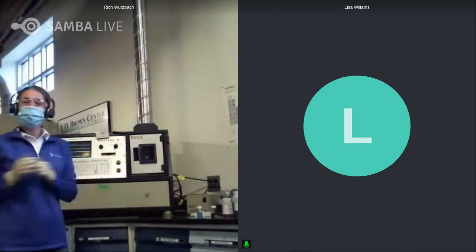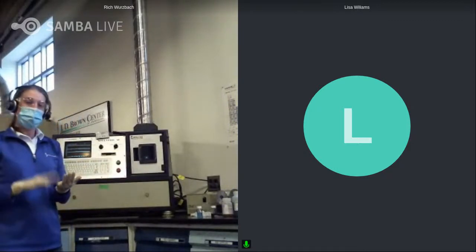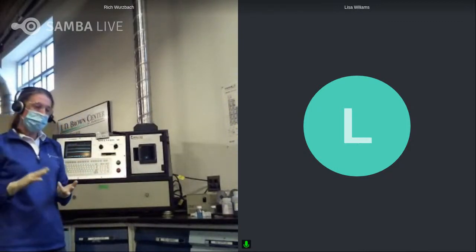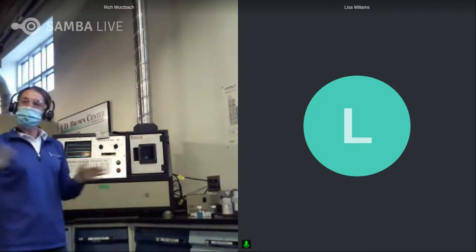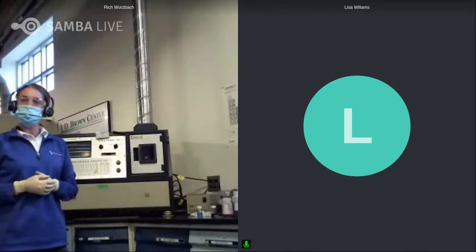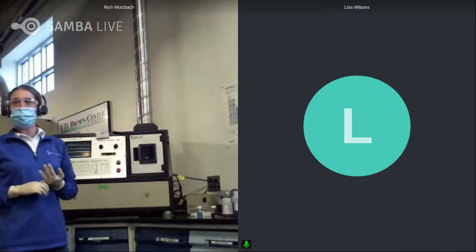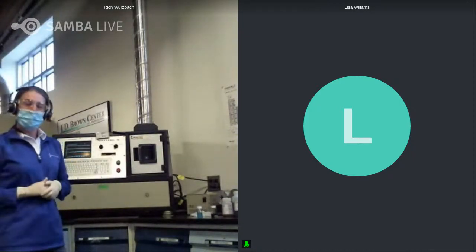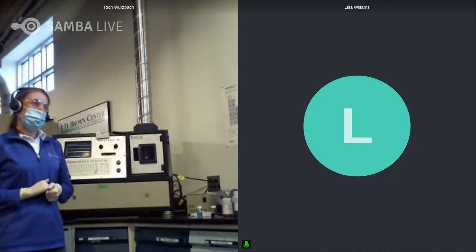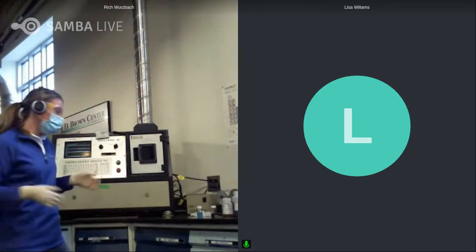So like I said earlier, one of the things I just love about the spectrometer is we're going to get a wealth of information from wear to contaminants to additives, and once we see what we get here, we're going to know which direction we want to go. Which instruments do we need more information on? Maybe we need to take an FTIR and understand what's going on there. Is there grease mixing going on? Maybe we need to run analytical ferrography. Maybe we need to get some more information from a grease mixing standpoint, those sorts of things.